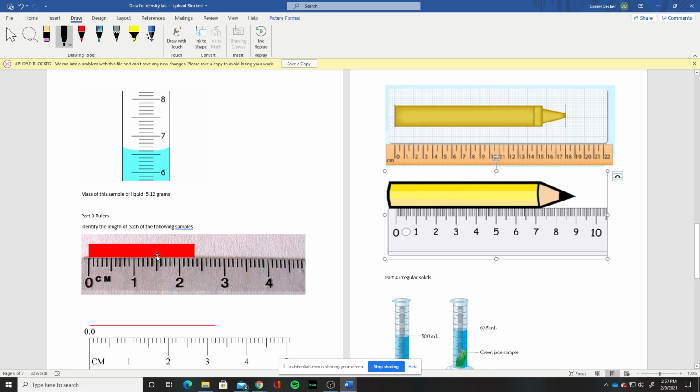So we have the red line here, the skinny red line here, this crayon, I guess, and then this pencil. So all you're giving me is just the size of the measurement there. And by the way, I realize that the pencil is going back behind the 0. Pretend like it's not. So just essentially read from the tip here down, and whatever you get from that, read that.